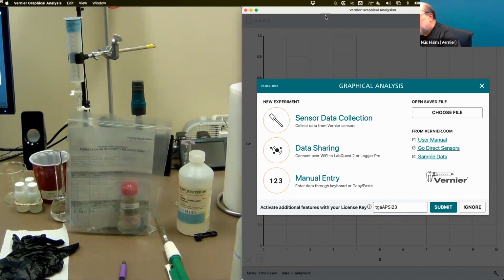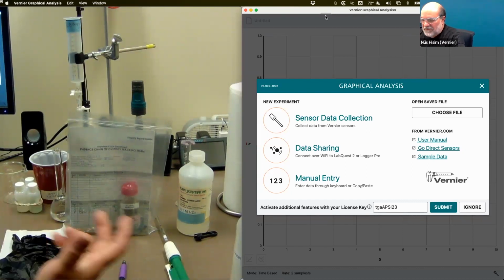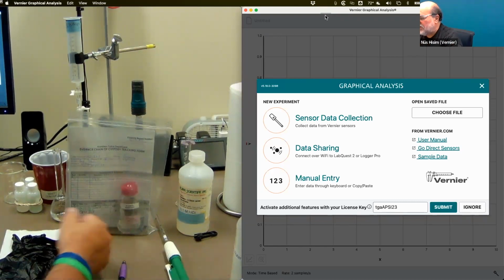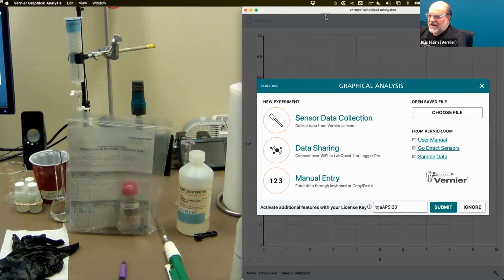Be careful. If you want to use a higher concentration, you can. But if you read the pre-lab, it says the concentration is suspected to be around 2 molar. You might have to edit that.